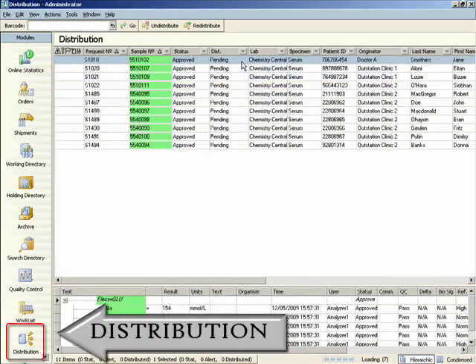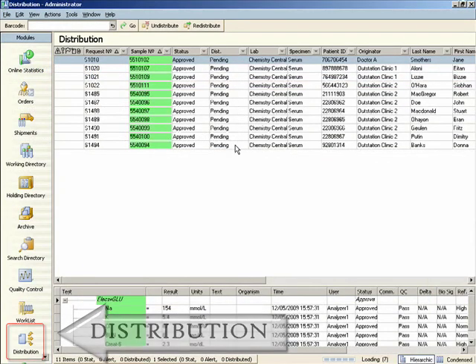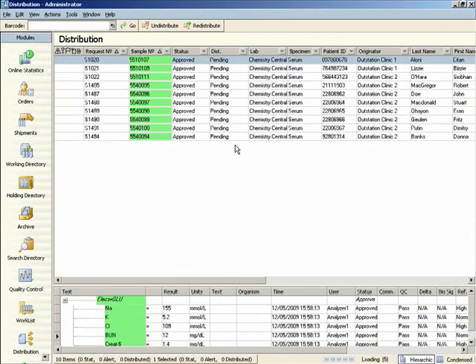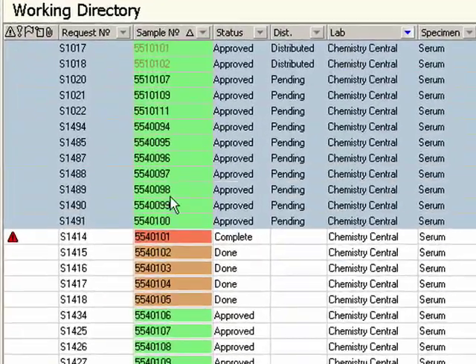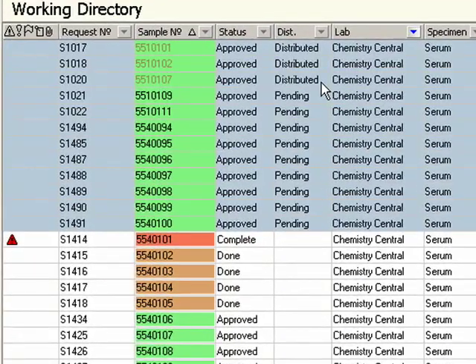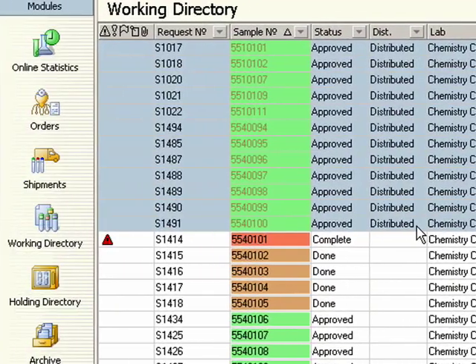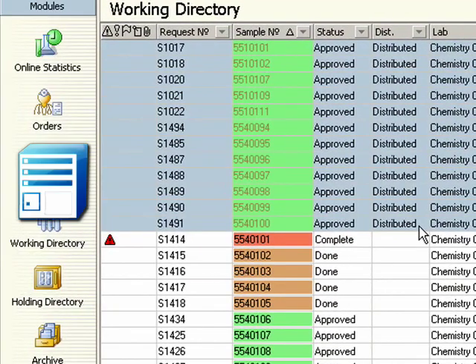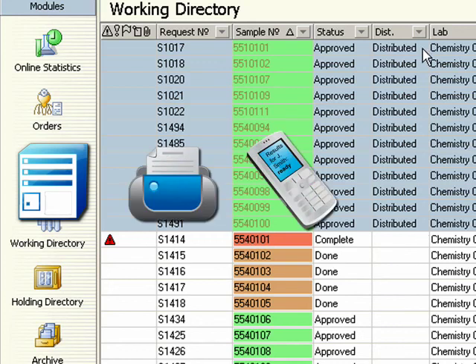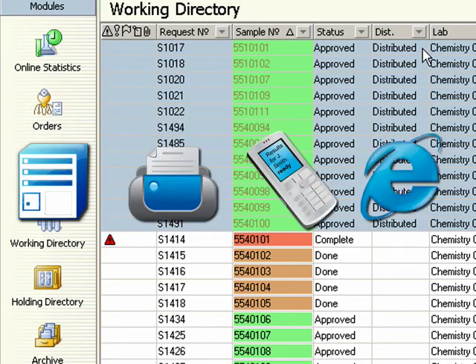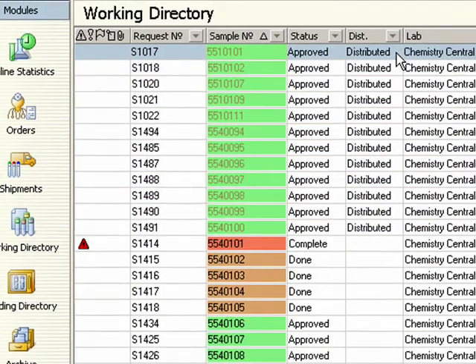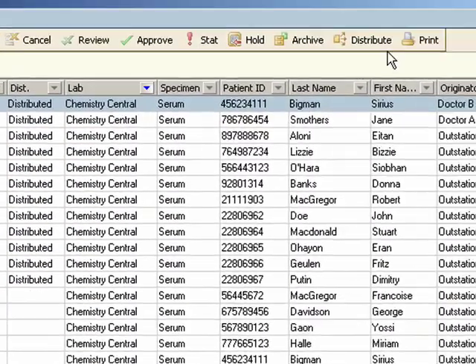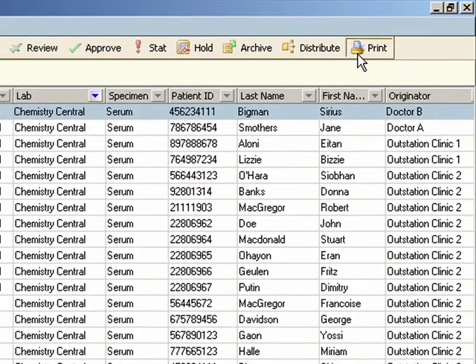You can distribute validated results to multiple recipients, including the patient, general practitioner, and request originator, over multiple media such as host, printer, mobile PDA, and via web access. You can also print one or more sets of patient results with a single click.